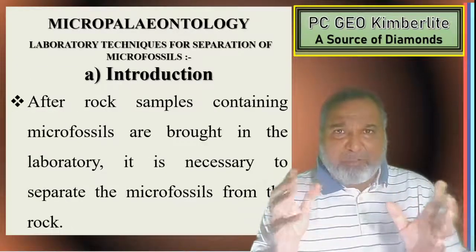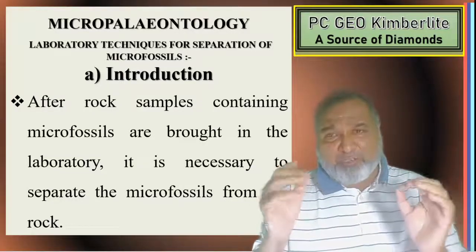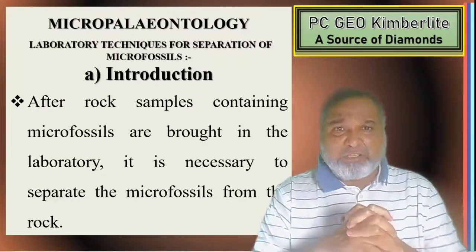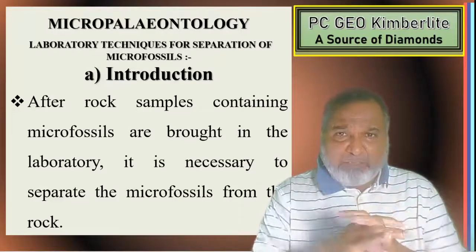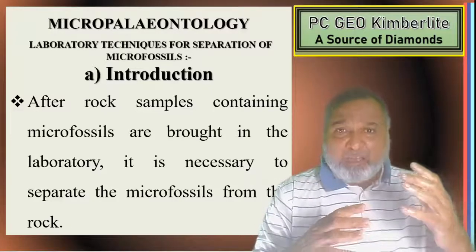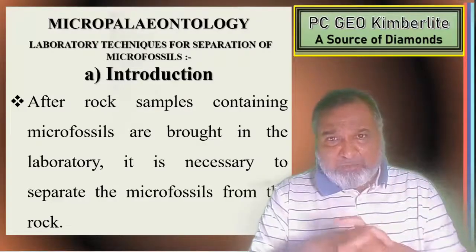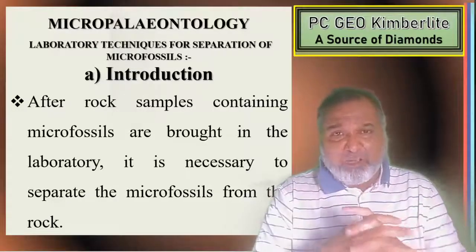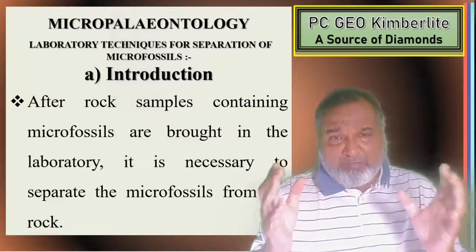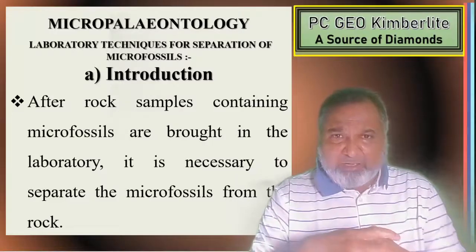So micropaleontology, that is, the laboratory technique for the separation of microfossils. First we'll see the introduction. After the rock samples containing microfossils are brought into the laboratory, when you are planning for microfossil sample collection, we have to give it thought. That we have already discussed in the earlier videos.